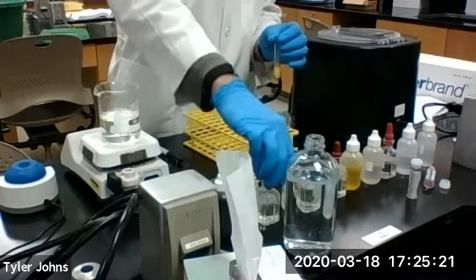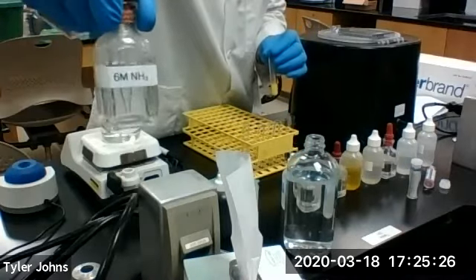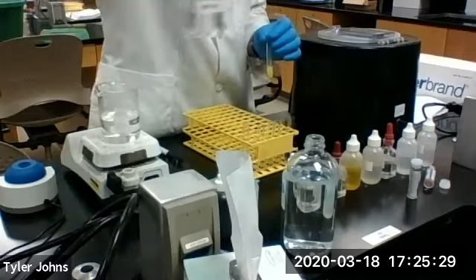We are now going to add 6 molar ammonia dropwise until the solution is basic.